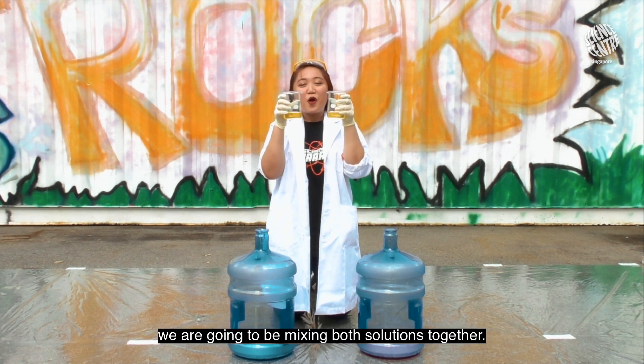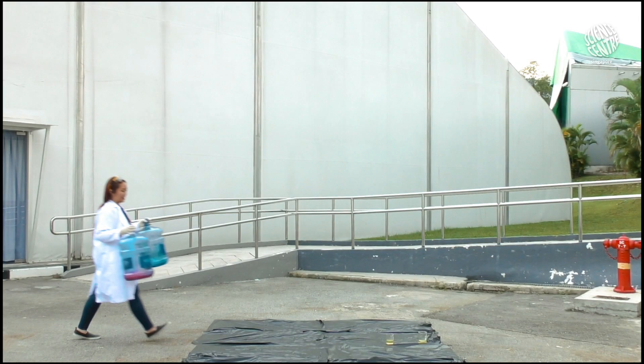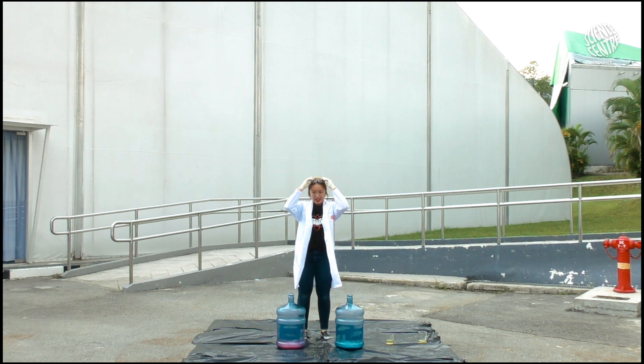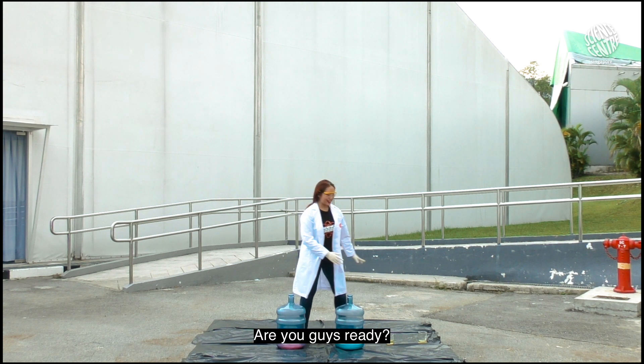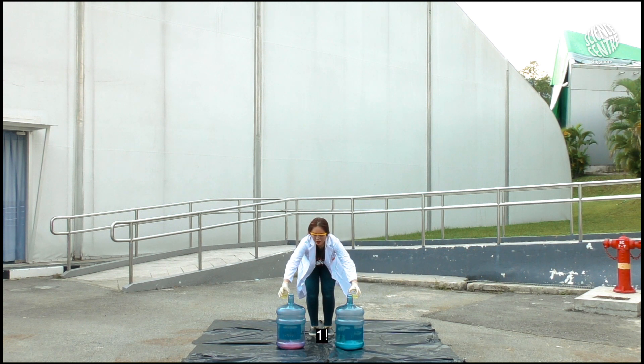And now for the fun part, we're going to be mixing both solutions together. Are you guys ready? In 3, 2, 1!